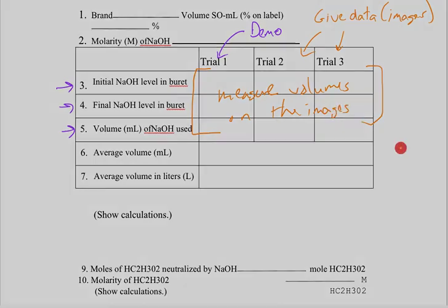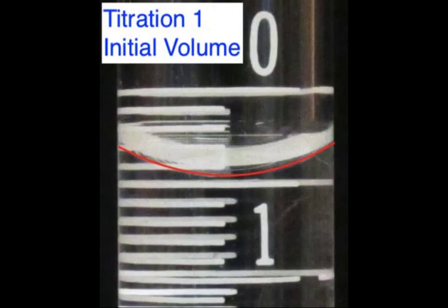And let's just talk about that just a little bit. So what I want to do here is actually walk through the process of determining the volume from a burette reading. And what you see here is the actual data from the experiment. So I'm going to give you the initial volume for the titration 1. You'll see this image in the video. These images are also posted on the PDF on Moodle, along with the volume measurements for the other 2 titrations. So from General Chemistry 1, you've experienced this to a degree, right? When water goes into a glass cylinder, there's attractive forces, pulls up the sides of the top of the water, okay? And that produces something we call the meniscus. And what I've done here, and I've done this in all the images, is I've highlighted the bottom of the meniscus. Honestly, this is easier to see than what you do in the laboratory.